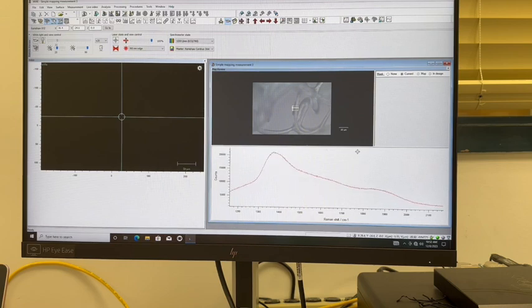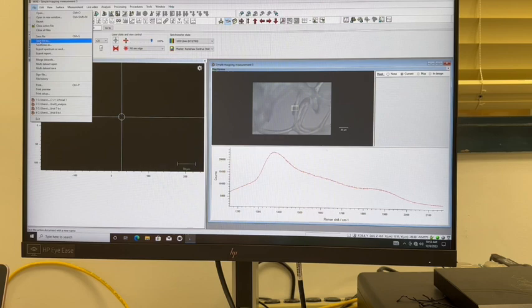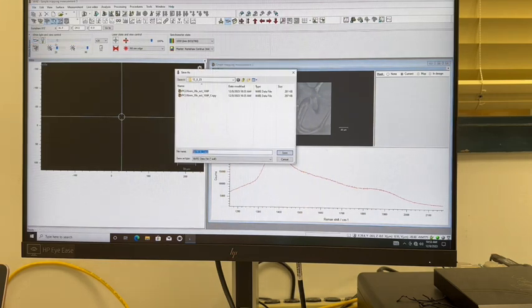As you can see, the different spectra at each point through the designated area. And you can see how the spectra changes when you are on the fibers versus not on the fibers. This mapping spectra looks good, so I will go ahead and save it 2 times, one as the raw data copy and one copy for analysis.